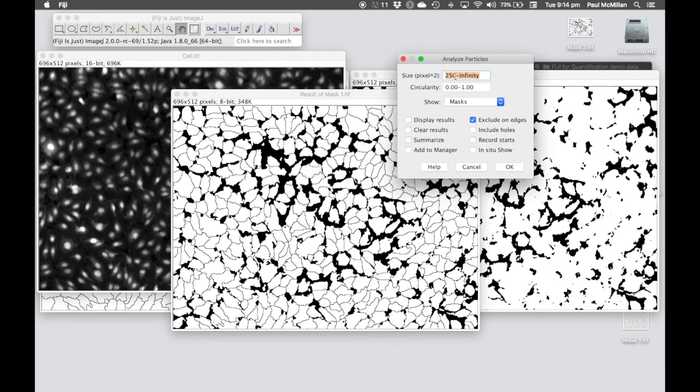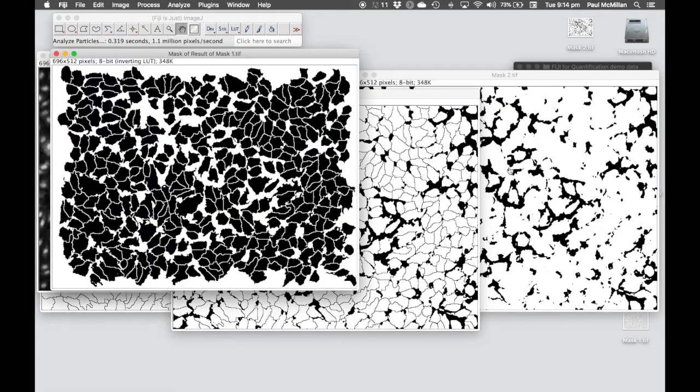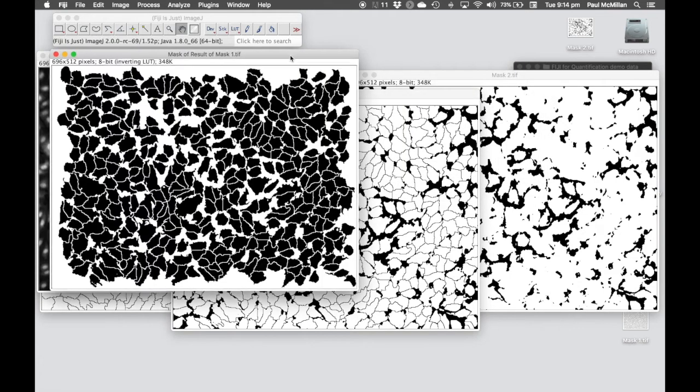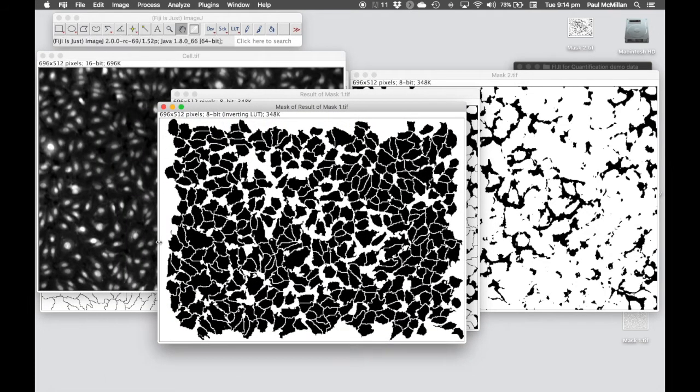In this case, let's filter from anything smaller than 250 pixels squared to infinity. We're going to exclude on edges, we don't want to show any results at this point, we're just filtering it out, and then we're going to create a new mask after this. If we click OK, we can see we've now got rid of anything that's touching the edges, so for our area readouts, we should be fine.